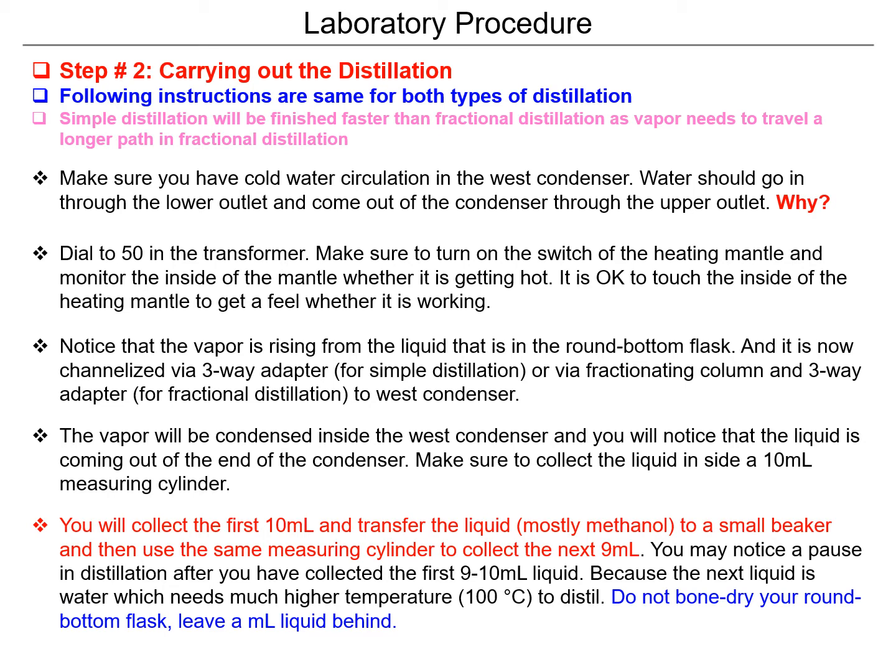Heating mantles have indicator signals — when you turn them on, they give a red light somewhere on the apparatus. But for some other reason they may not, so you can just carefully touch the inside of the mantle — it feels like a wall — and feel that it is warming. If it is warming, then you can be sure the experiment is ready to go.